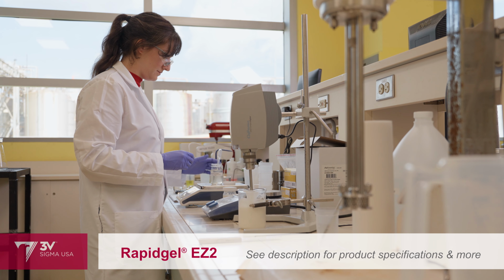Because Rapid Gel is pre-neutralized and pre-dispersed in a lipophilic solvent, it goes into the water very quickly and can be added at any stage of the process. It's also contributing to the soft and slippery sensation of the lotion.